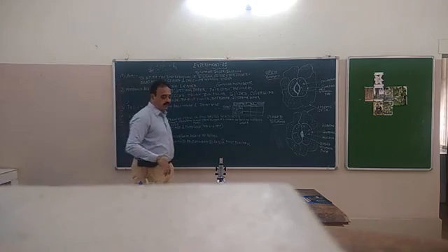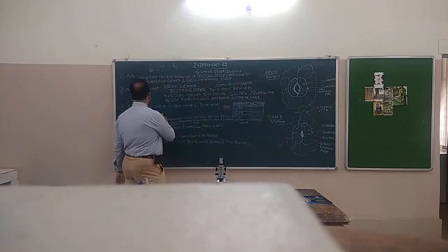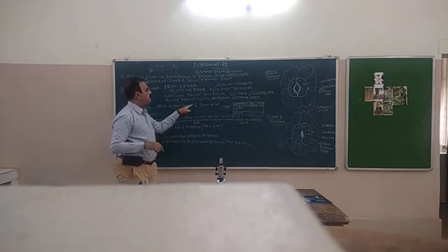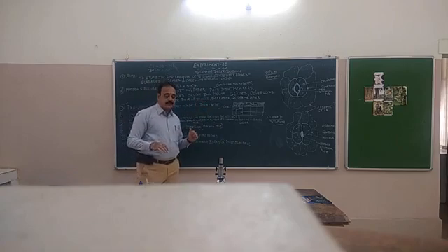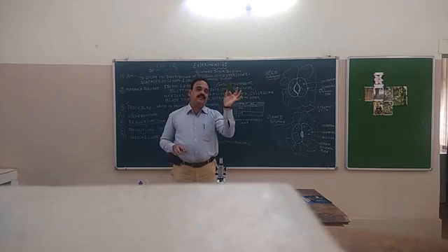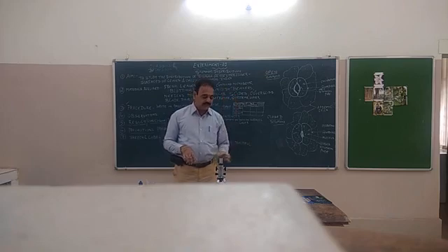And the procedure, what you do. Already I gave a caution to you that since you are performing the experiment, you should write the procedure in the past tense and point-wise. Don't write stories, don't write paragraphs, right? In past tense and point-wise. Like first point, a fresh leaf is taken. Now, this leaf has to be fresh and devoid of any disease, any fungal disease. So, a fresh green leaf is taken.